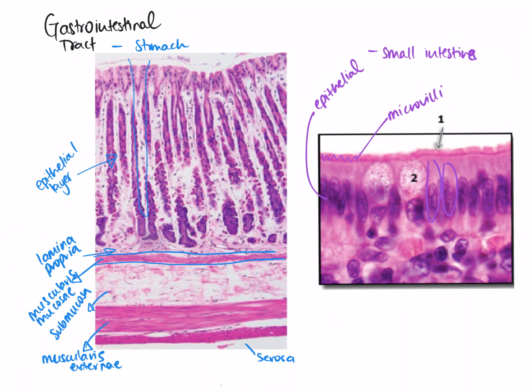And Vidya, would you have any idea of what these cells that are sort of clear in appearance and are labelled as 2 sitting amongst the epithelial cells are in the small intestine? So those cells are goblet cells, and therefore they are mucus-producing cells, producing mucus so that they can line that region of the gut. Thank you.